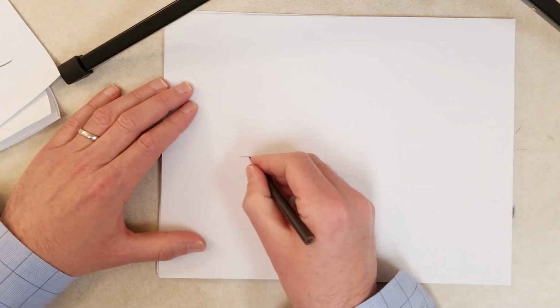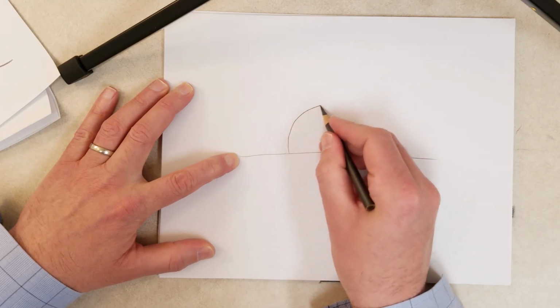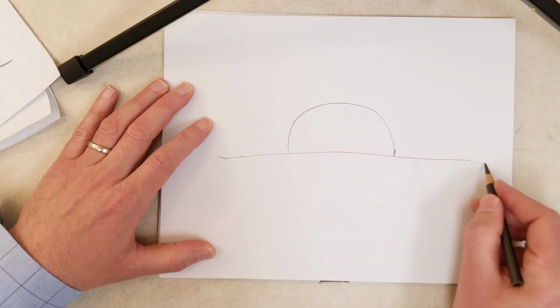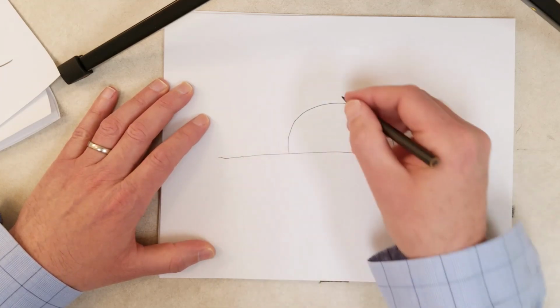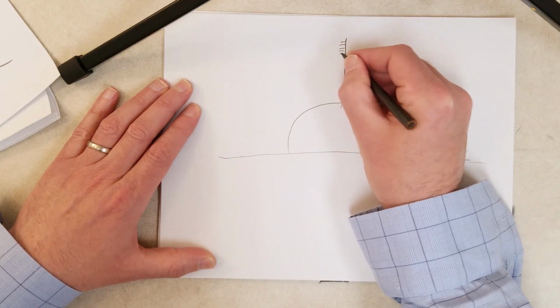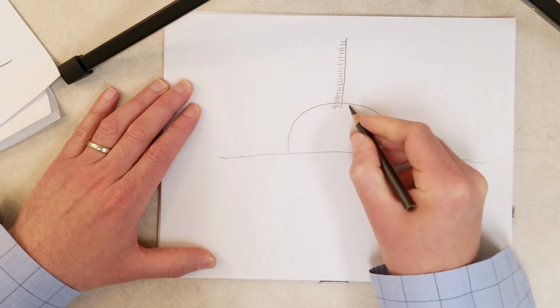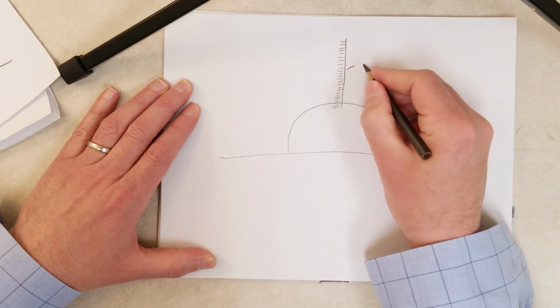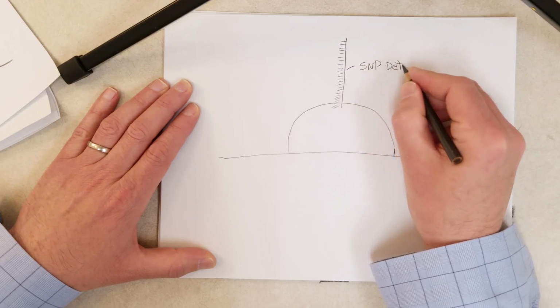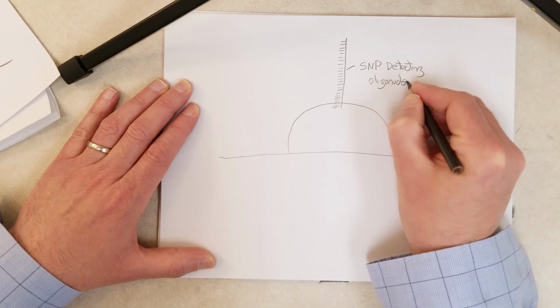Let's look at one bead. Imagine this is the surface of the slide, and this is the bead that is embedded. This is one of the million beads embedded into the surface there. Now that bead is going to have attached to it what we are going to call an SNP detecting oligonucleotide.